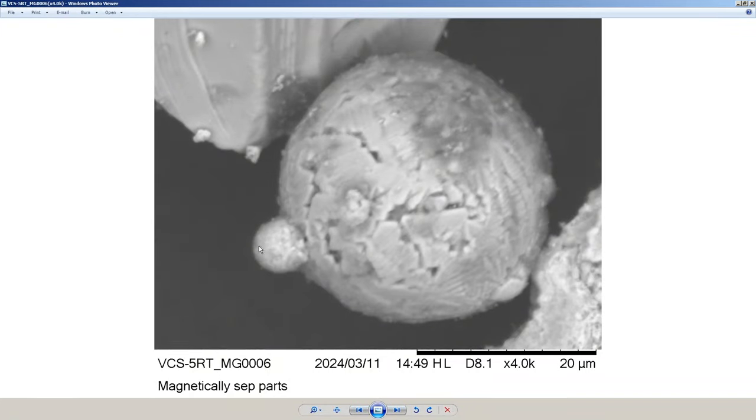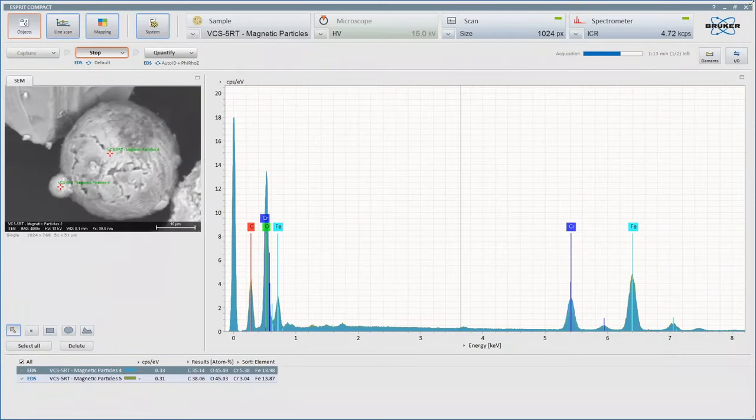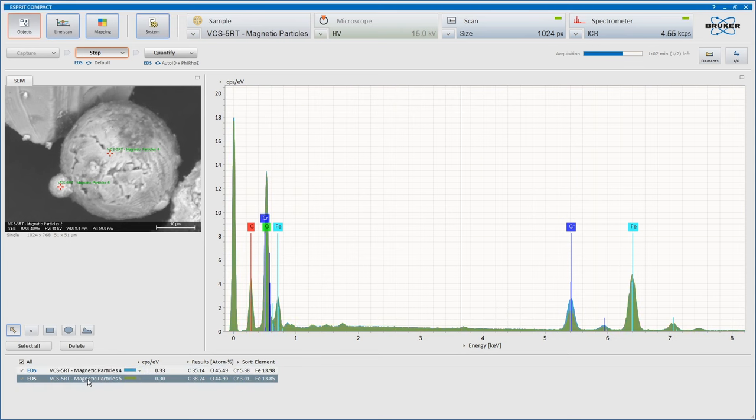So here you can see there's even the crenellations on this one here. Very clear crenellations here, but maybe because it has some chromium in here, you don't get the perfect kind of structure. Again, here this smaller one has a small amount of chromium in it. Otherwise, it's the same iron, oxygen, and carbon mix. Okay, so we will go and have a look at some other areas.